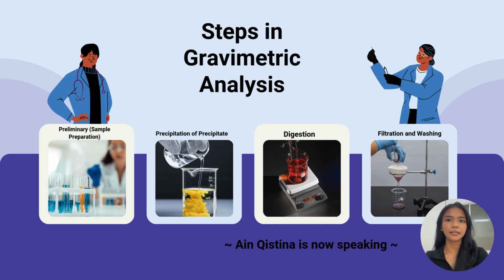Digestion is a process that improves particle size. Digestion helps small particles grow into larger ones, which are easier to filter. It also increases purity, where impurities that might be trapped in the precipitate are reduced, making the precipitate purer. And it also helps with easier filtration, as larger, denser particles filter more easily and reduce the chances of losing any material.